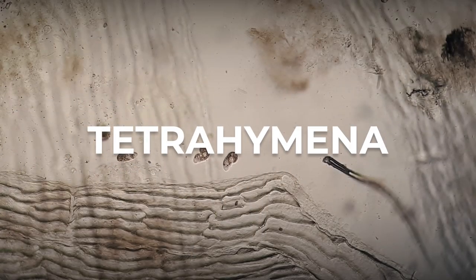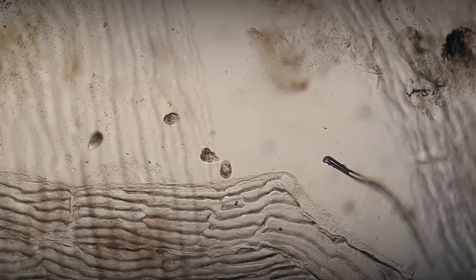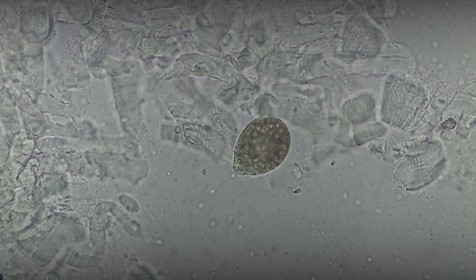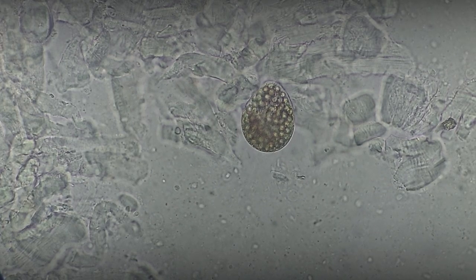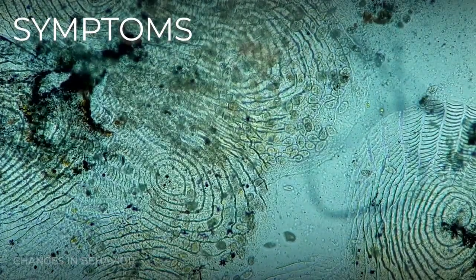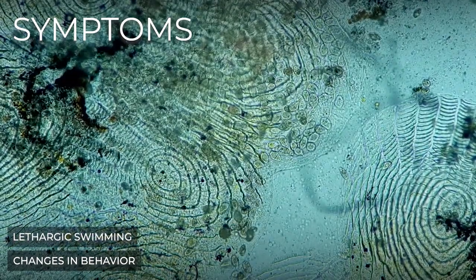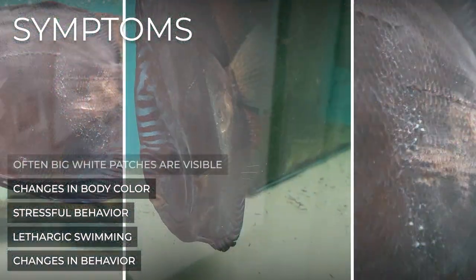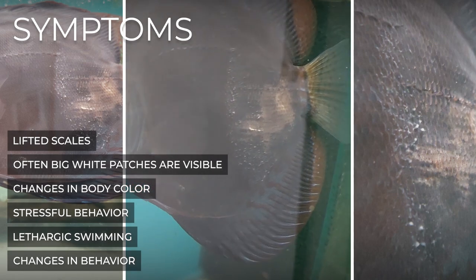The genus Tetrahymena belongs to the family Tetrahymenidae, which includes about 70 species. Tetrahymena looks like a drop of water with a pointy nose, and many internal organelles can be seen. Tetrahymena causes changes in fish behavior — for example, lethargic swimming and stress — as well as changes in body color. A lot of times you see big white patches and lifted scales on infected fish.